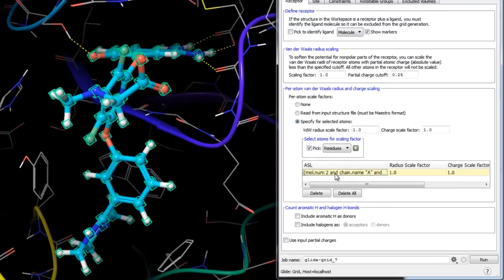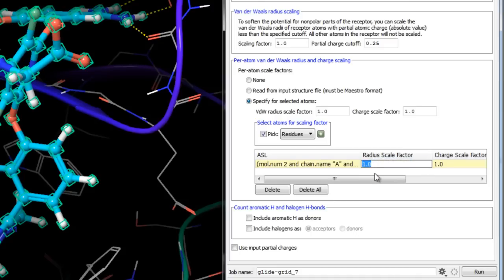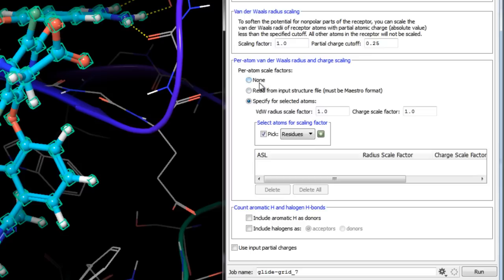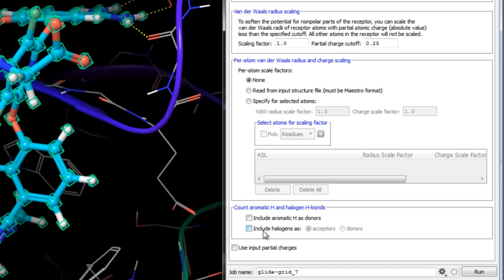In this example we won't apply any scaling factors. In addition to normal hydrogen bonds included in grid generation, there is an option to account for other non-covalent interactions — namely hydrogen bonds to aromatic hydrogens, hydrogen bonds to halogens where halogens are treated as acceptors, or halogen bonds where halogens are treated as donors. Although technically not hydrogen bonds, these are included as a class of weak non-covalent interactions.